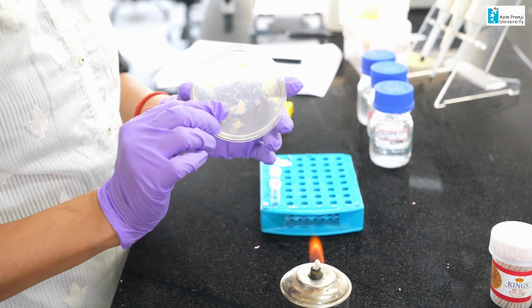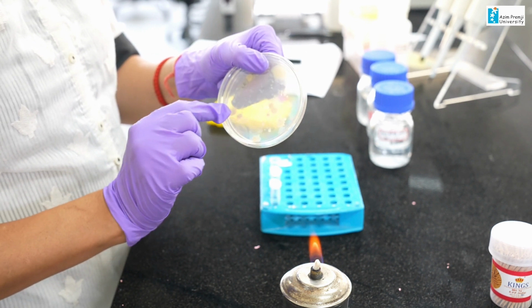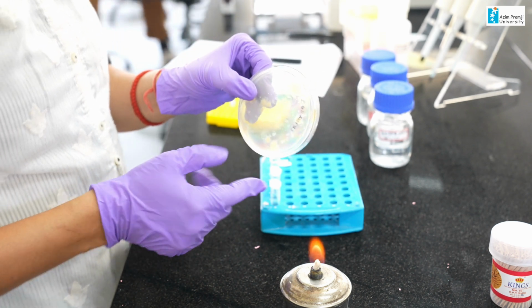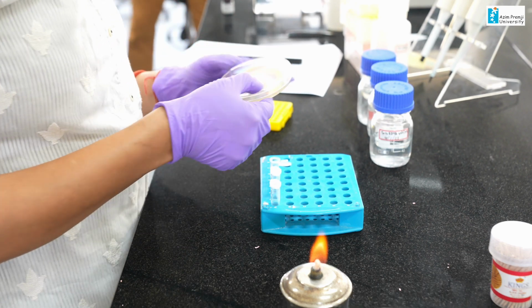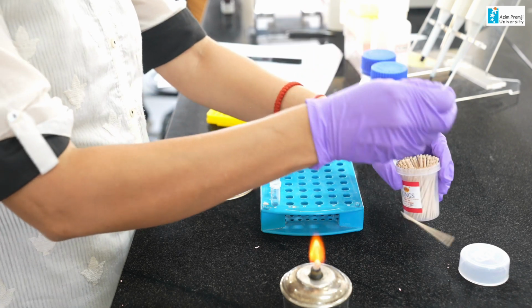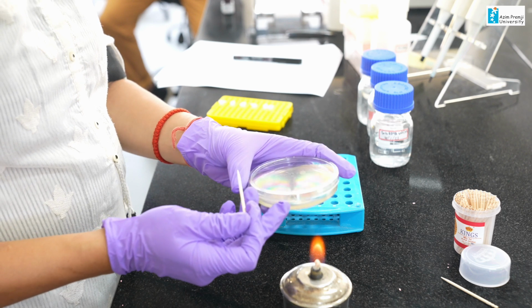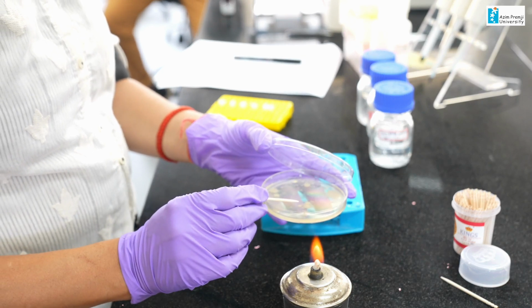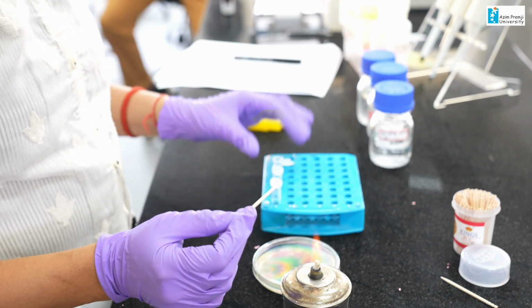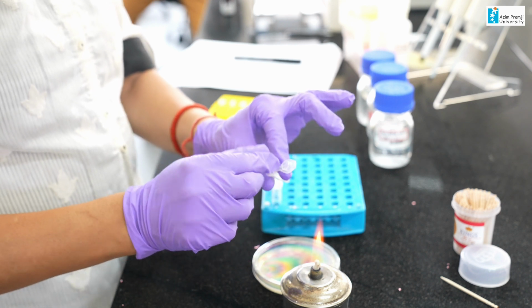You can see here I have a bacterial plate. You can see the individual colonies. From the back side it is very clear to observe the colonies. I am going to take a sterile toothpick and transfer a colony into the solution which I have taken there, and mix it thoroughly.